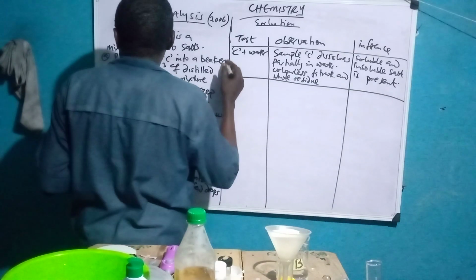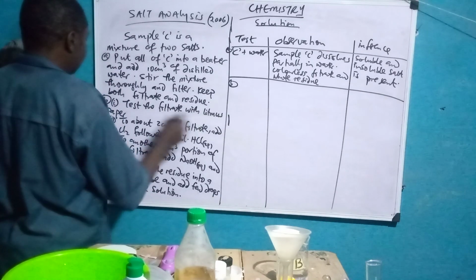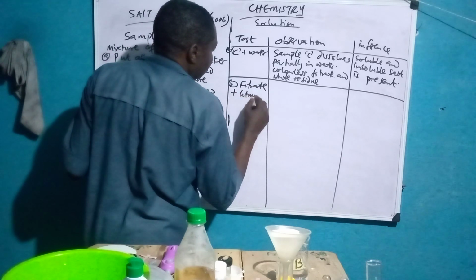That's B. Test the filtrate with litmus paper. Filtrate plus litmus paper.